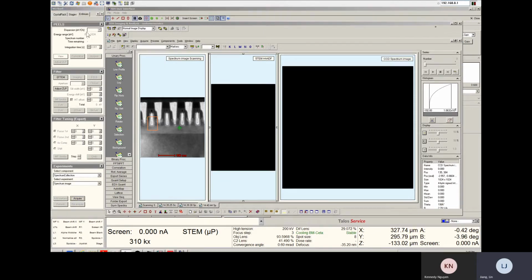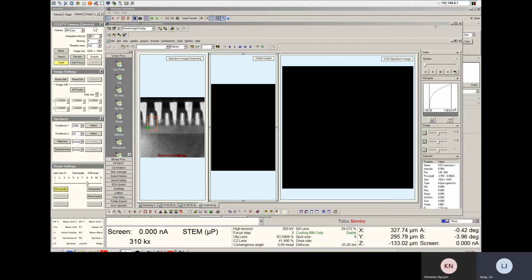I probably need to go for single frame camera. I'll reset up that. Can go single frame, 0.1. Otherwise, it takes too much time, it takes a lot of time, and then I can see.